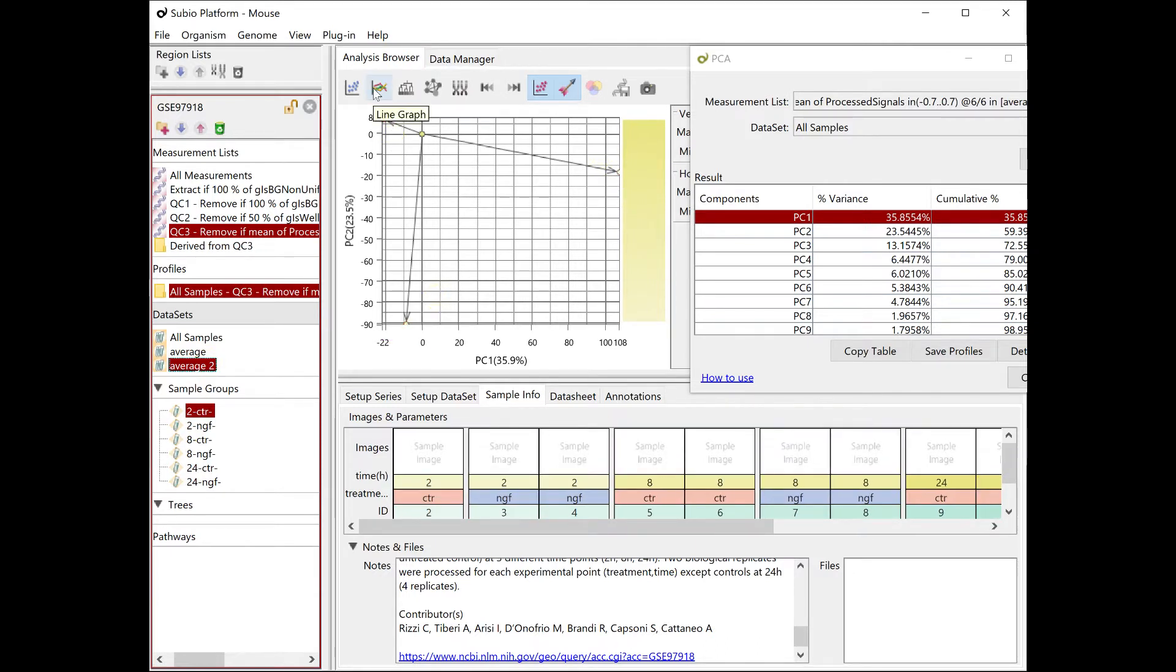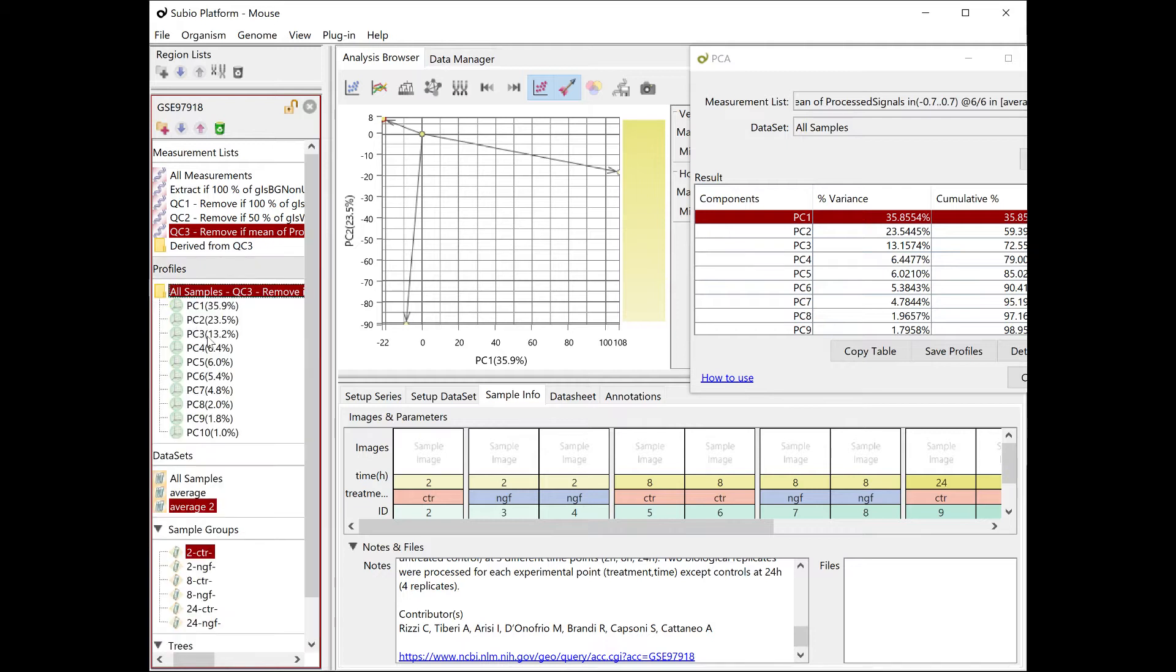If you select the average two dataset, it draws arrows radiating out from the origin, which represents the control.